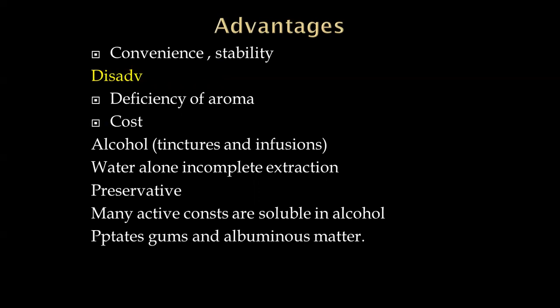Here, the lack of aroma. In the first few days or weeks of the preparation, you can feel the aroma matter. But after a few weeks or months, every time you open the container, the volatile matter easily evaporates. Since in this concentrated infusion we are using alcohol, the expense is quite high compared to fresh infusion.